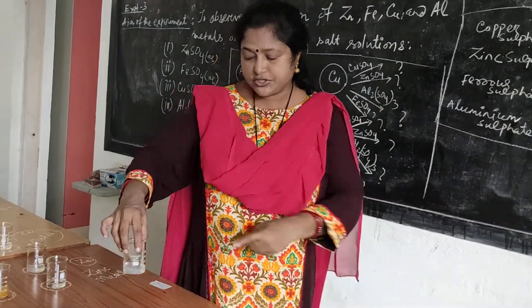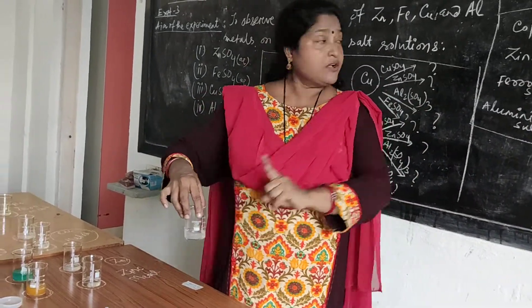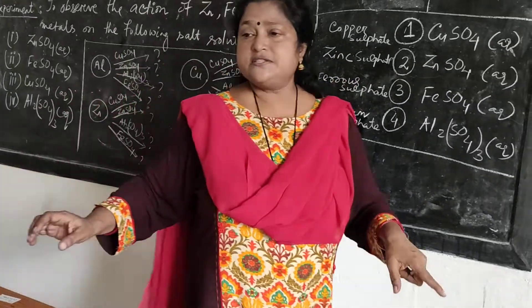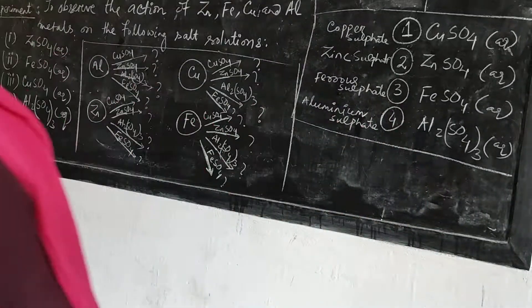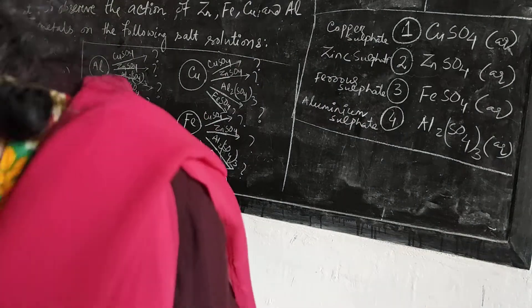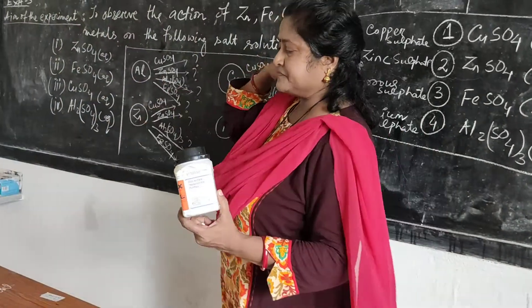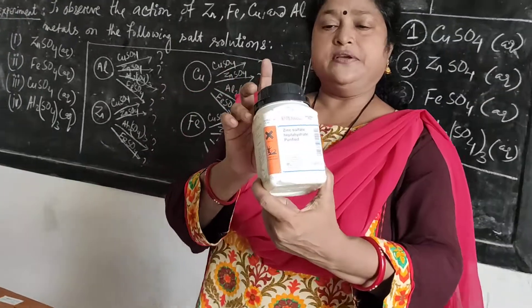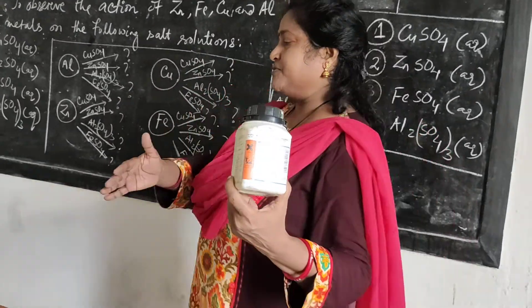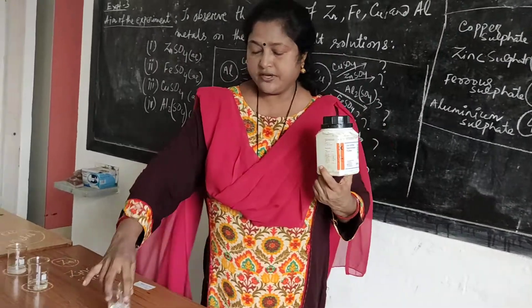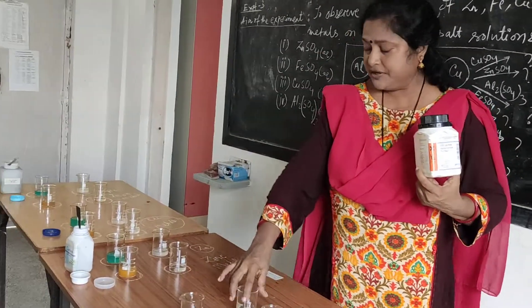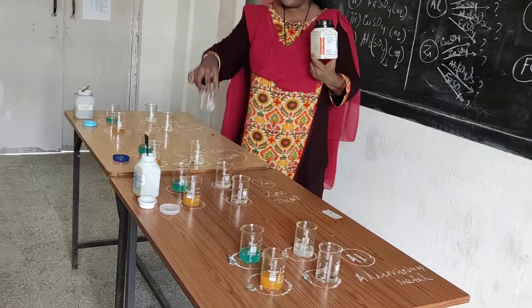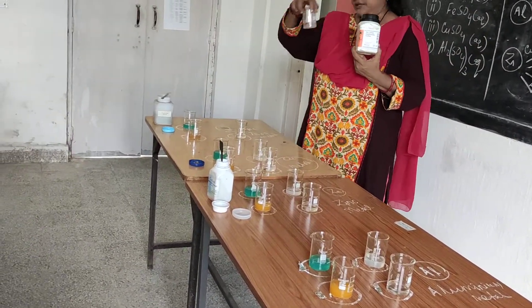Then beaker 2 — position 2. Beaker 2 is zinc sulfate solution. This is my zinc sulfate. I have taken zinc sulfate solution — zinc sulfate solution in water.